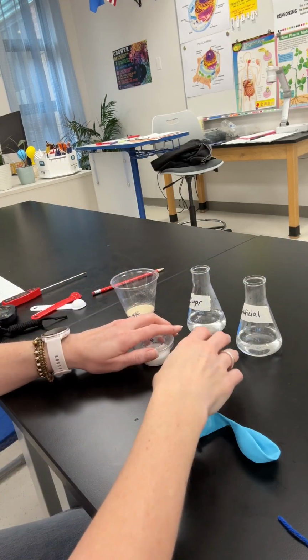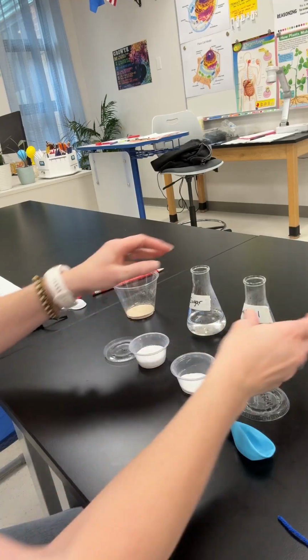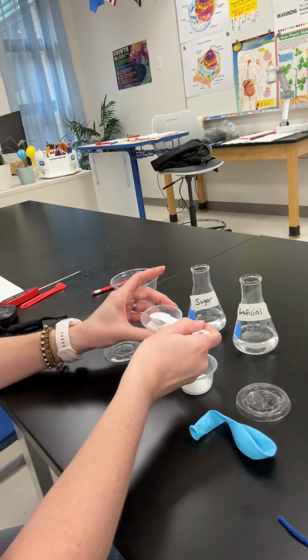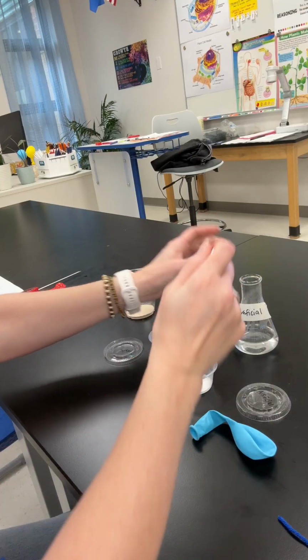Okay, so to start, I've got 50 milliliters of water in each of those. Let's see if I can tilt these a little more. I'll give each one a teaspoon of their sweetener.